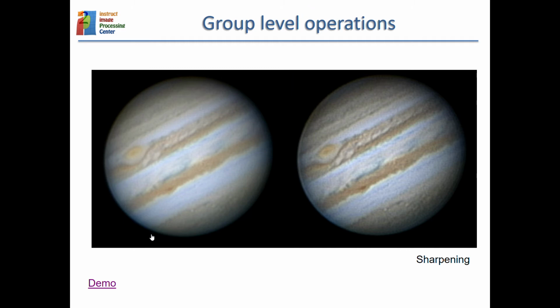You can see that here we have very little blurring, just a bit, so we don't see the very fine details, and then we have a little bit more blurring and even much longer blurring. So a large blurring kernel means that many pixels that are far away from the central pixel contribute to the final value of the central pixel.